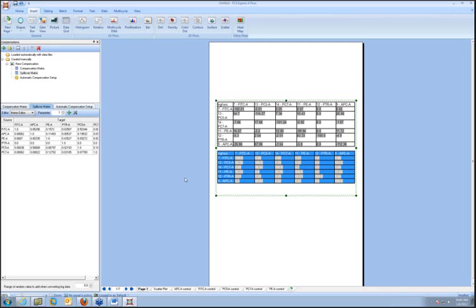I did want to reiterate that I showed a lot of advanced details that are in step 3 and step 4 towards the end that are rarely used, only by really advanced users.